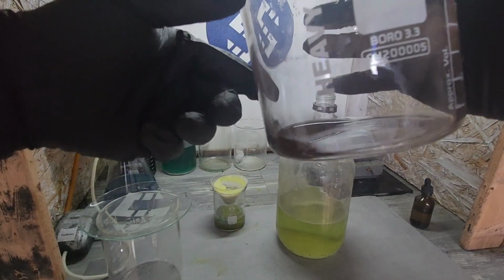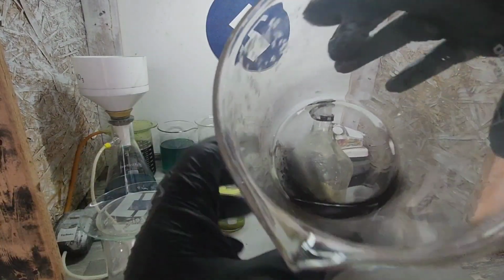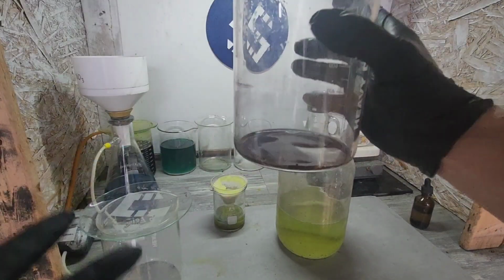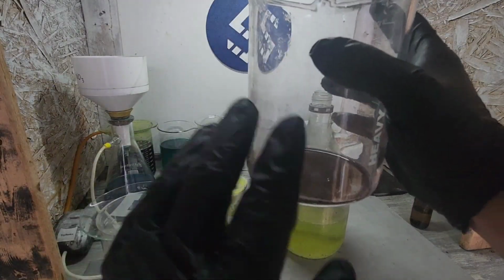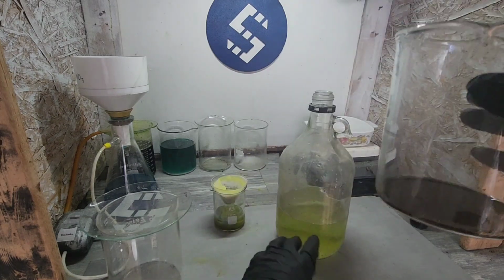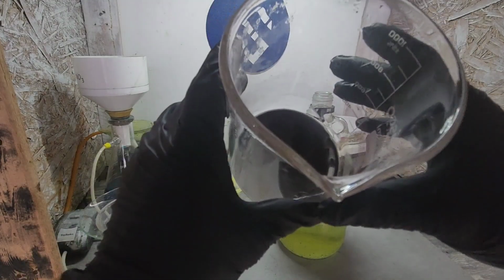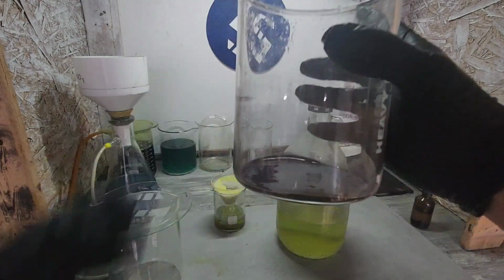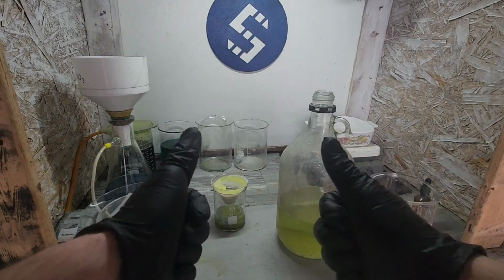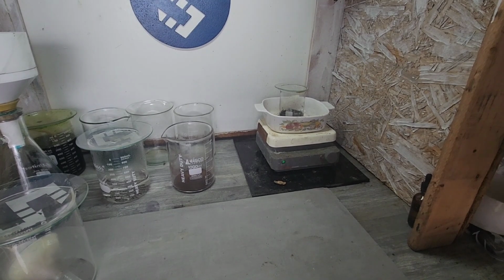I would say that's a pretty decent amount there. You can see that it's quite thin in some places. So we'll just keep this like this, and I'm not going to clean it much more than just the rinse. I wanted to rinse all the rest of that stuff off of there because, like I said, it was in a concoction of goodies. And so we'll go ahead and redissolve this if we get anything out of here. Hopefully. All right, let's see what we got going on here.